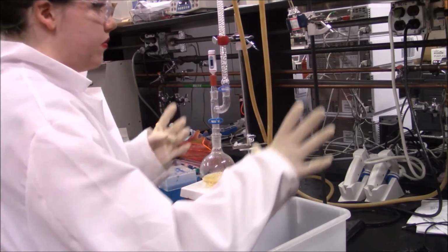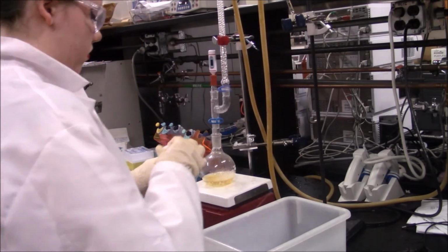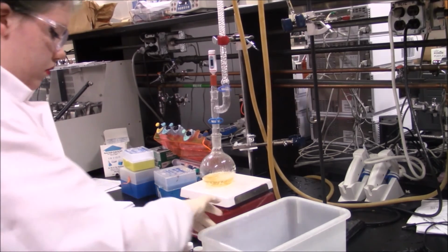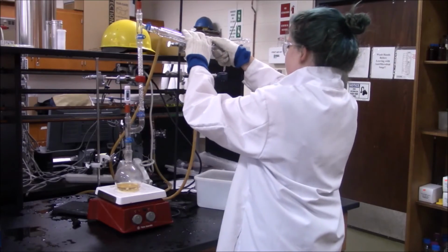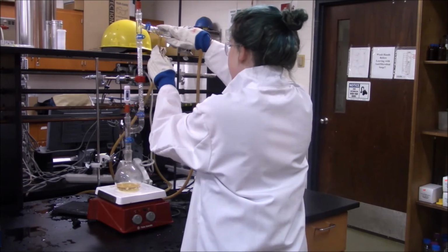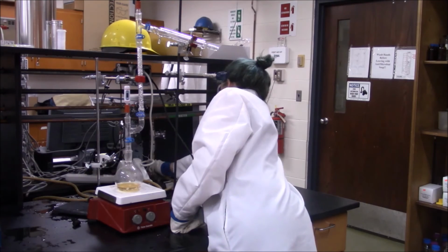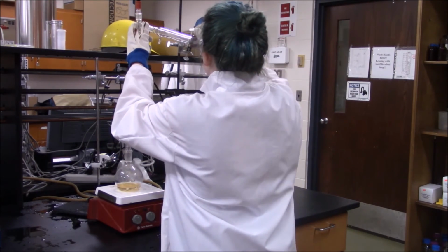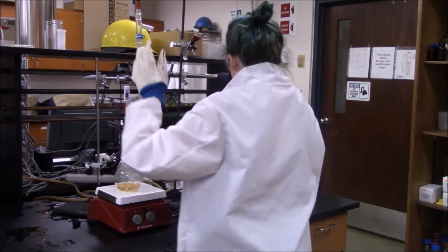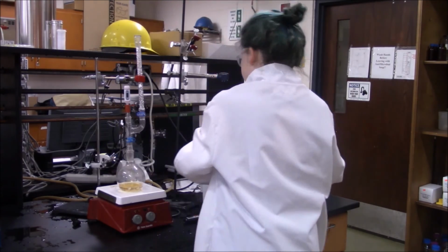Turn off the hot plate and wait for product to stop flowing out of the end of the condensing column and wait further until the bottom flask has reached 50 degrees Celsius or less. Once the apparatus has cooled, carefully disassemble the distillation kit and pour the remaining solution from the flat bottom flask down the drain. Wear heat-resistant gloves at this time, as the flat bottom flask may still be hot. Remember to turn off the tap before disconnecting the hose from the water-jacketed column.